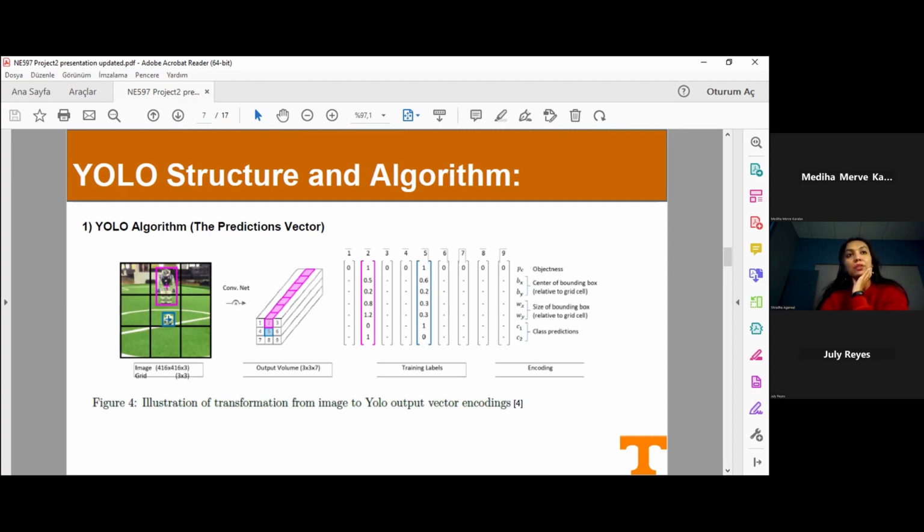And now how do you predict these bounding boxes? Because while training, you are just providing bounding boxes. Now, what is the next thing? Your algorithm sees the image, divides the image into the grid, and then what happens? Firstly, it divides the grid cells, and based on the center pixel of the box, it defines an output vector.